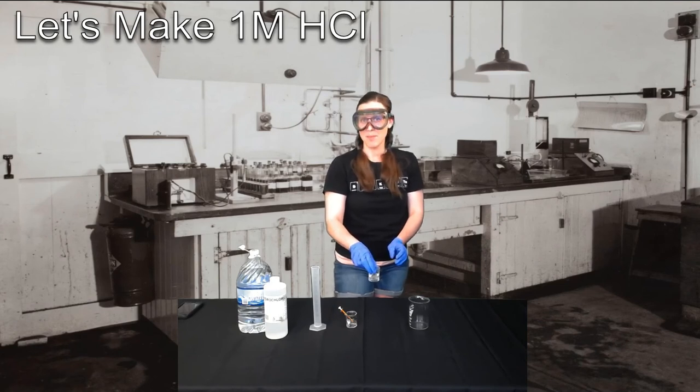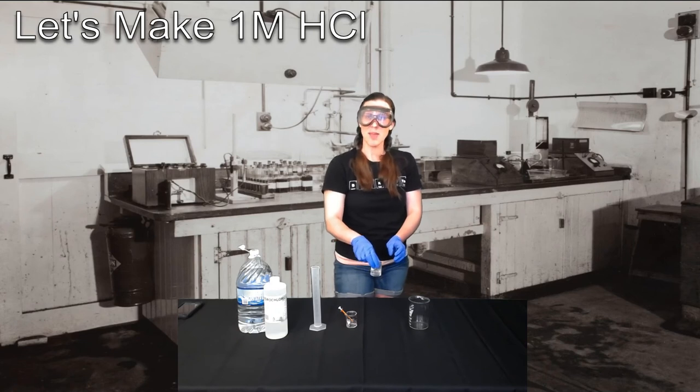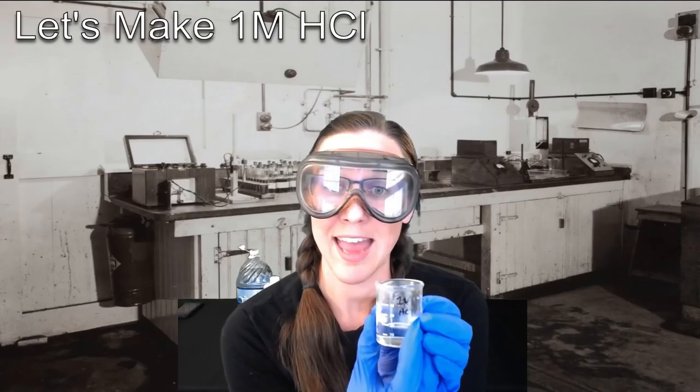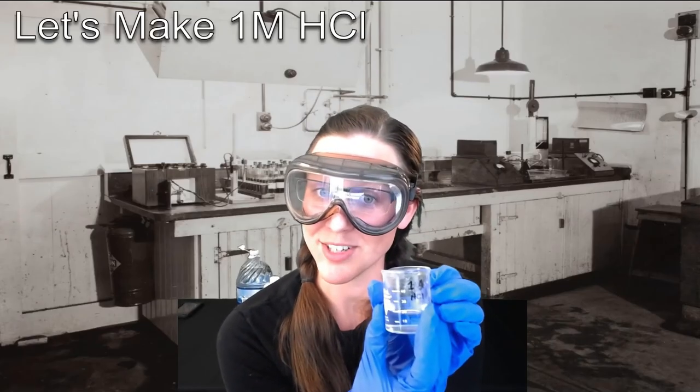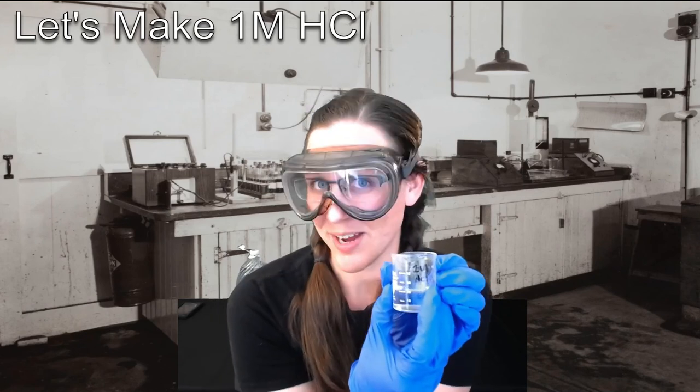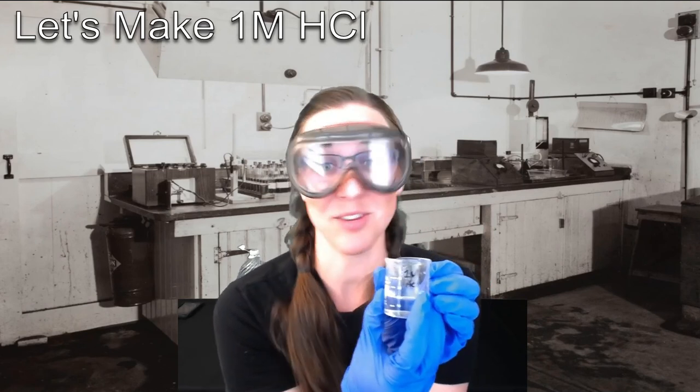Now I'm just going to swirl that up a little bit so I can mix it together. If you are in a lab with a magnetic stir plate and a magnetic stir bar, you may wish to have that stir for a while on the stir plate. And now I have 20 milliliters of 1 molar hydrochloric acid thanks to our dilution equation M1 V1 equals M2 V2.